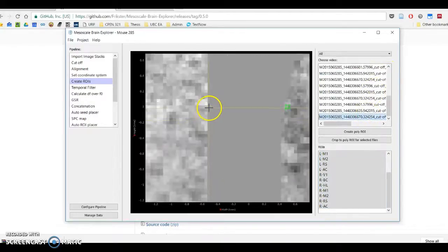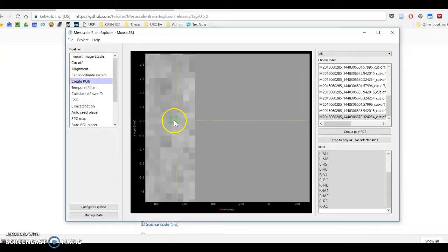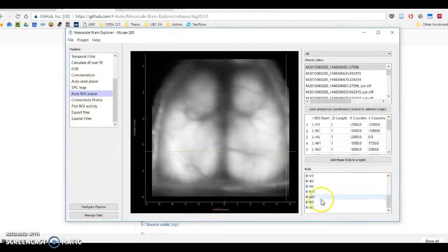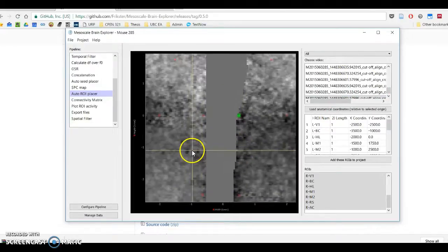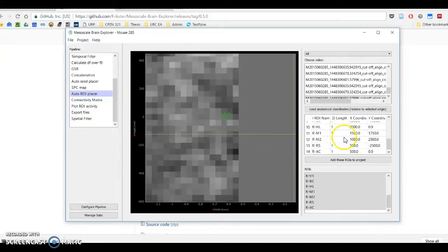So what we can then do is click on this guy, move him a bit to the side, and then save it. And we can do that to this one as well, that is a bit off to the side, and then save him as well. And what we should notice then, going back to this, is that sure enough, their new positions have been updated. Note, of course, we can also update the size.